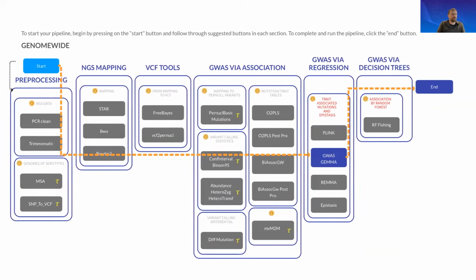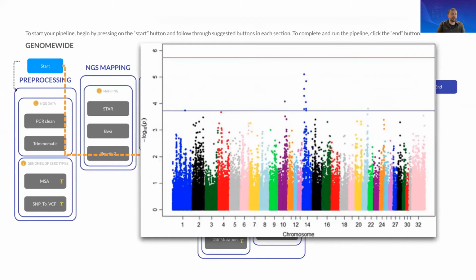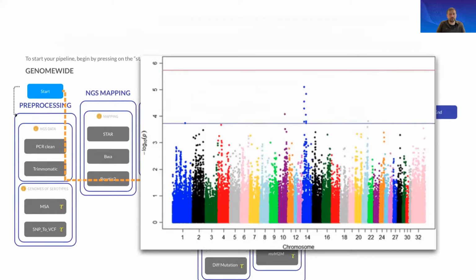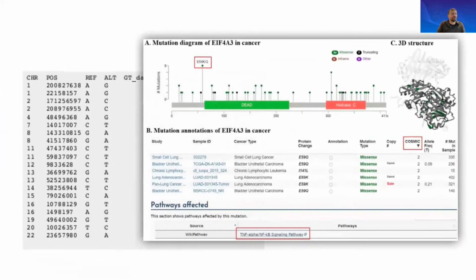It will be performing genome-wide association studies and identifying what particular positions on the genome can be associated with a phenotype. We're also going to look at how different types of changes have an impact on the structure of that particular protein. And all of this will be provided to you as a series of practical steps that you can perform independently over the course of the next 3 months.